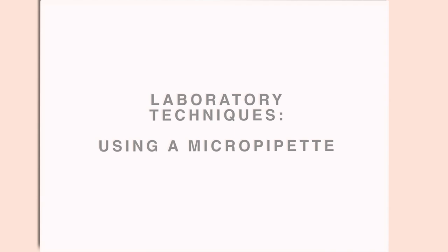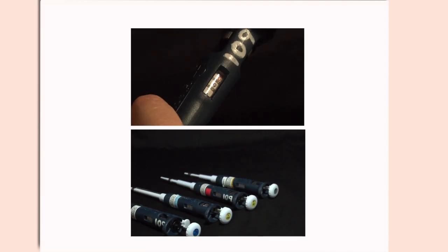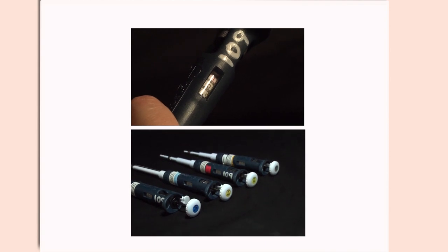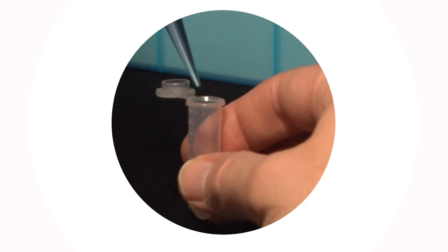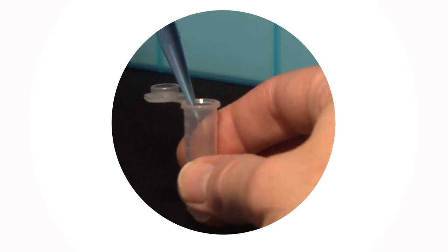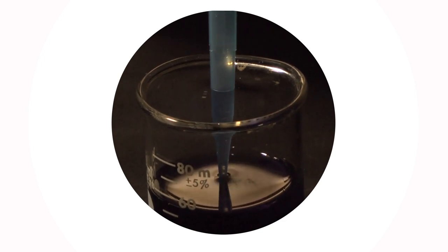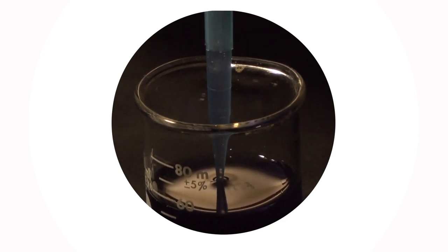Using a micropipette. The micropipetter, or automatic pipette, is one of the most important tools in the laboratory. It is used to dispense microliter quantities of liquids. Because this is a highly precise tool in the laboratory, care must be taken during its use.